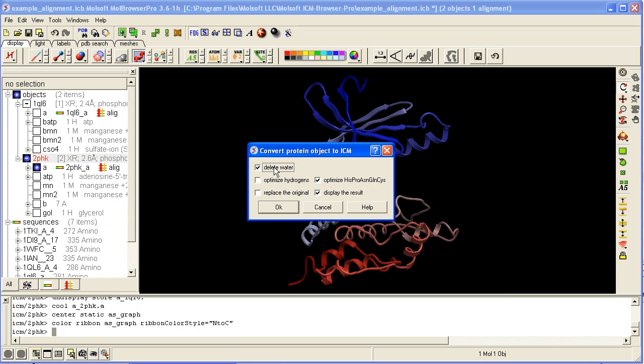You then have options to delete water or not. You should always optimize all the hydrogens, or if you want a quick conversion, you can just optimize the histidines, prolines, asparagines, glutamines, and cysteines.